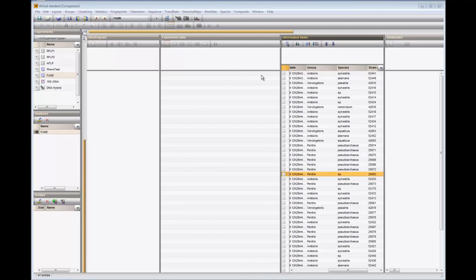PCA, or Principal Component Analysis, is typically executed on complete character data. It does not work on sequence types. Fingerprints can only be analyzed by PCA if a band-matching table is first generated.